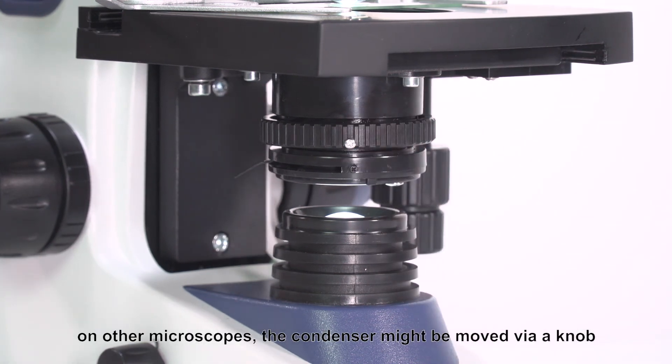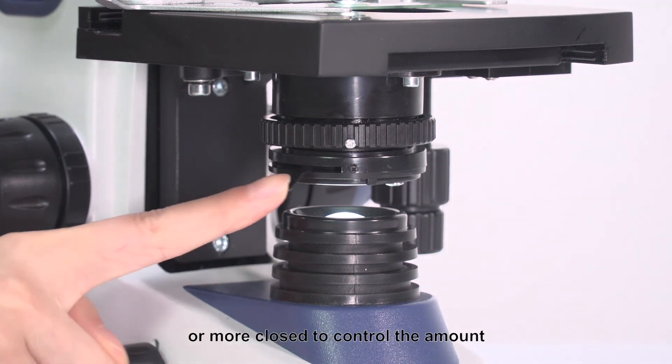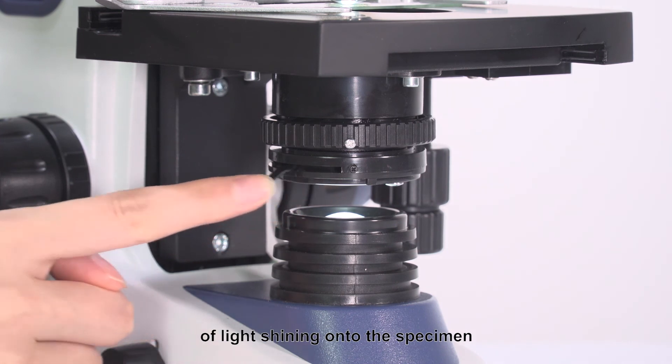On other microscopes, the condenser might be moved via a knob. The iris diaphragm can be slid either more open or more closed to control the amount of light shining onto the specimen.